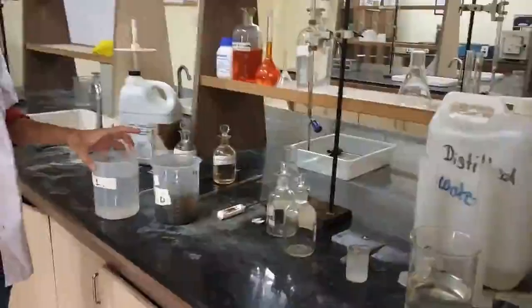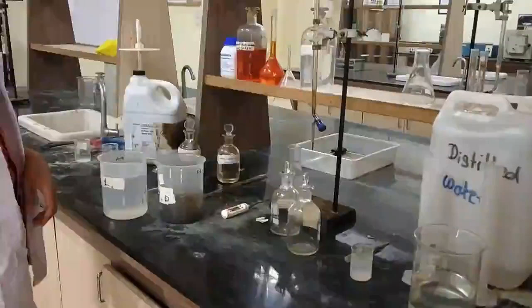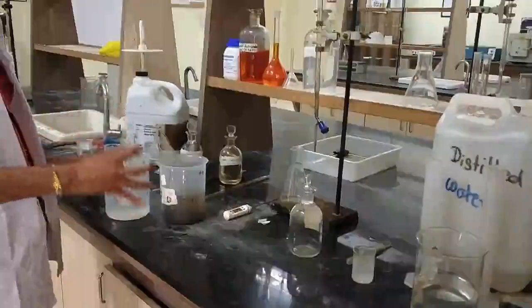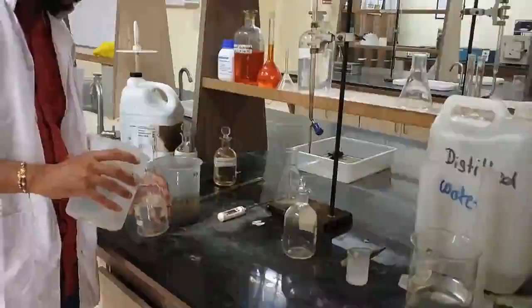So the very first step in our experimentation is to fill the sample in the reagent bottles, right? We have 300 ml BOD bottles, and we are going to fill the sample in both of these bottles. This is the tap water.